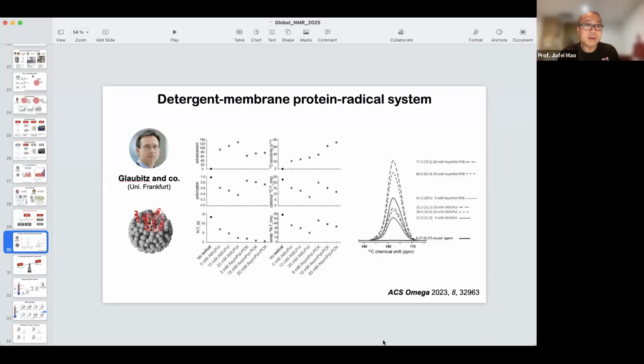So basically, in the world of biochemistry, it's all about the assays. In the world of material science, it's all about the functional measurements. Depending on which material, you always have a functional readout. And basically you add your particular DNP juice and see if it interferes with the particular function of your target.